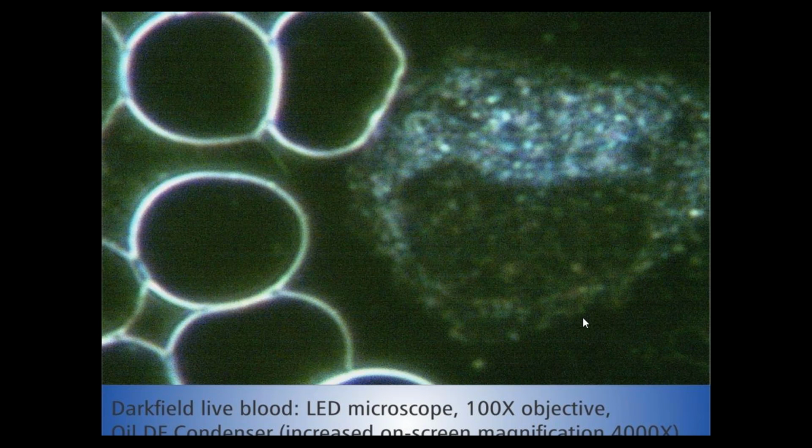Yes, definitely. Well, connecting a camera to one of the eyepieces is really not the ideal way of doing it, because you are sacrificing one of your eyepieces, and also because the camera then being there makes it nearly impossible to then use the other eyepiece. The best way, as you said, is to have a dedicated camera tube in the head of the microscope. Now the term used for these types of microscopes is trinocular, whereas the microscopes that don't have a separate camera tube are called binocular.